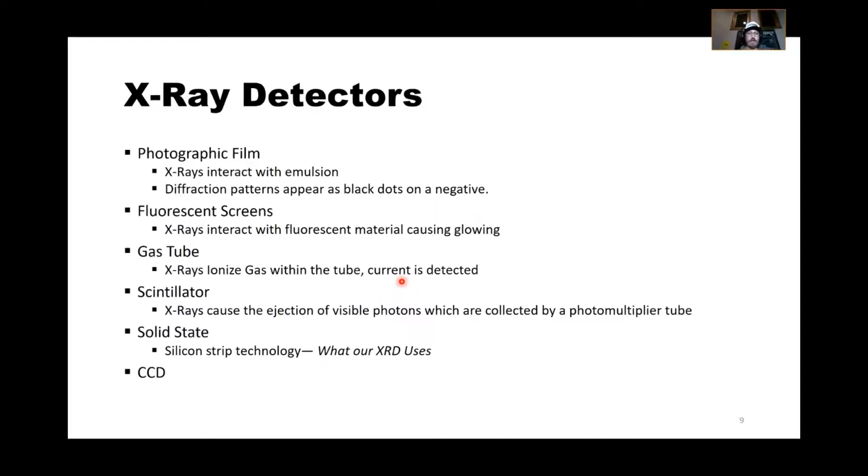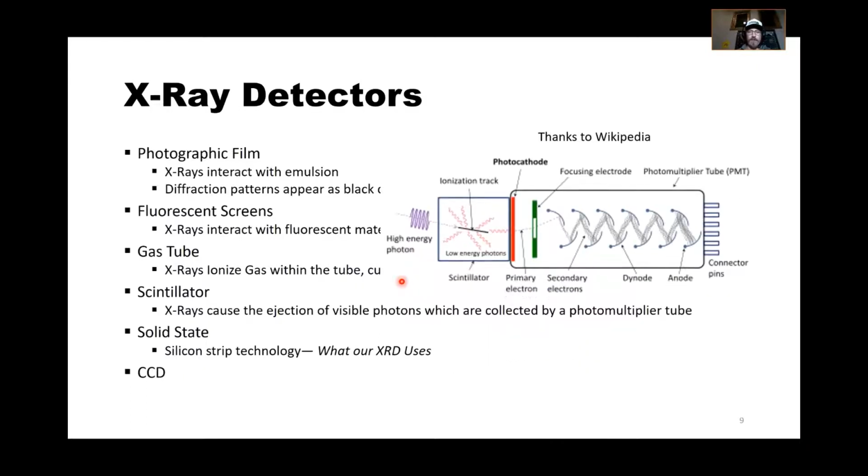And I really do like scintillators. We see scintillators time and time again in our equipment. And an electron detector is also a scintillator on scanning electron microscopes. I borrowed this diagram from Wikipedia to talk about it.